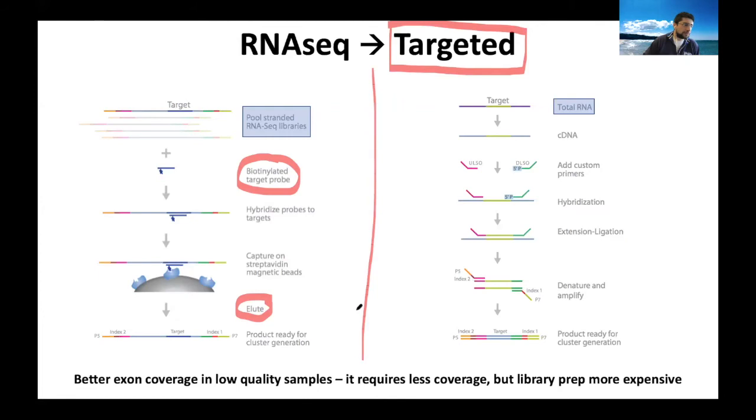I performed the library preparation with ribosomal depletion on the RNA sample we were discussing before with the RIN score of 2.3, and also with the targeted approach. And the targeted approach gave me much better results. Unfortunately, when you're doing ribosomal depletion on a very degraded RNA, you might have a huge background of RNA that is coming from everywhere, basically.